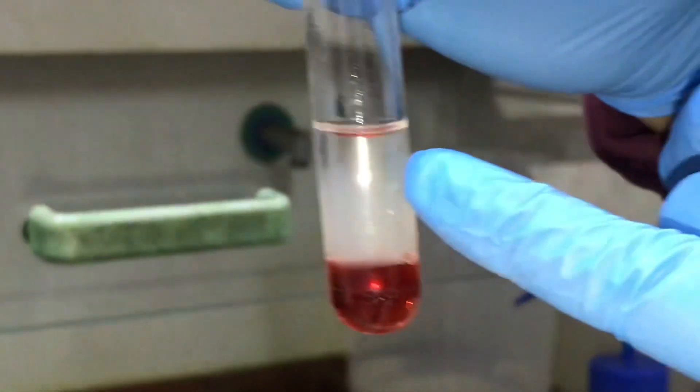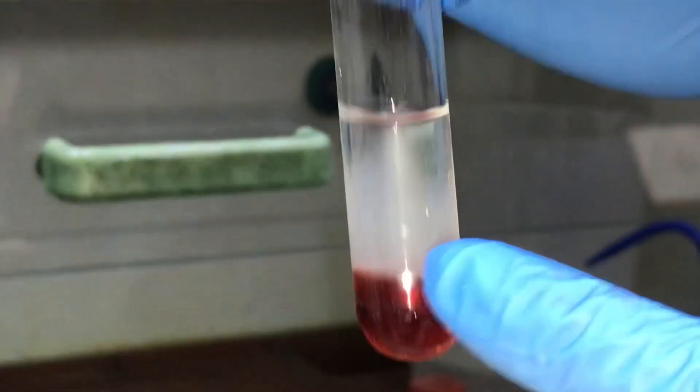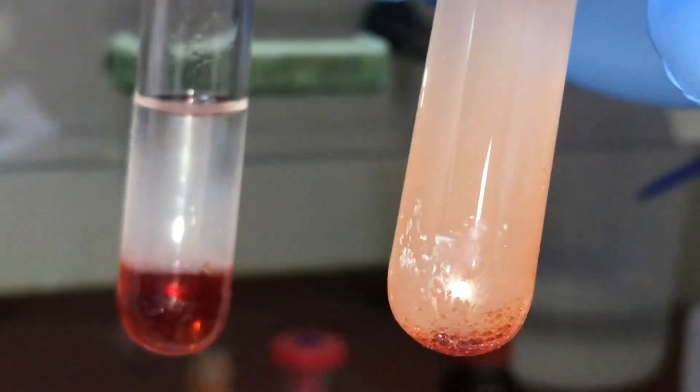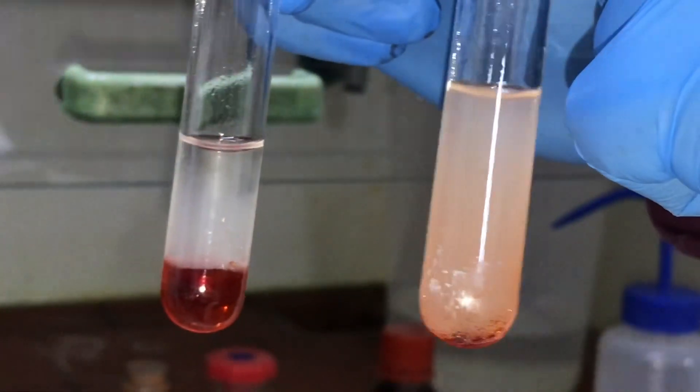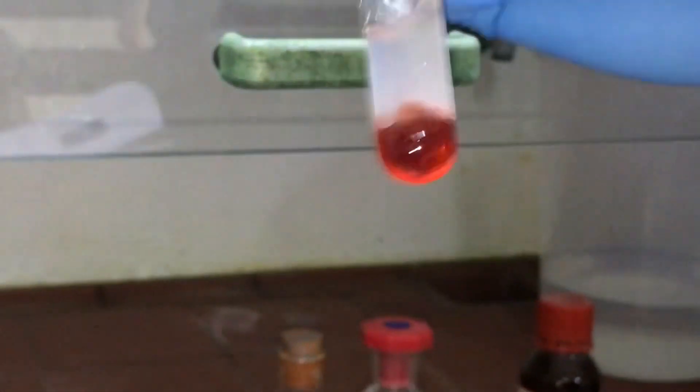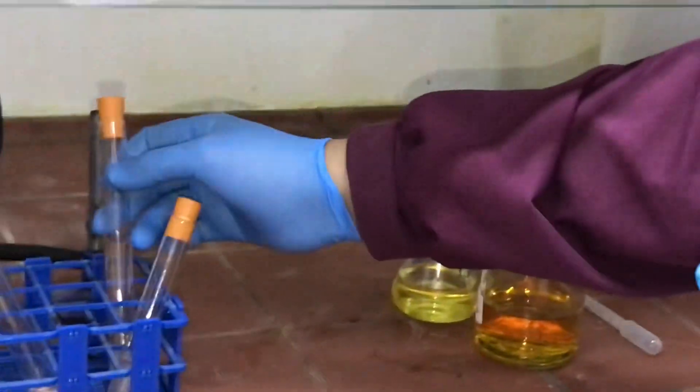You can see this white precipitate just above the bromine water. It's no longer orange. You see this precipitate, and if you leave it a little longer, it will settle even further.